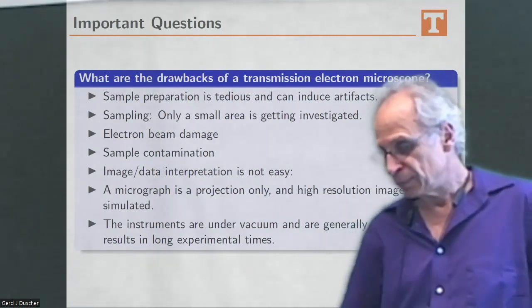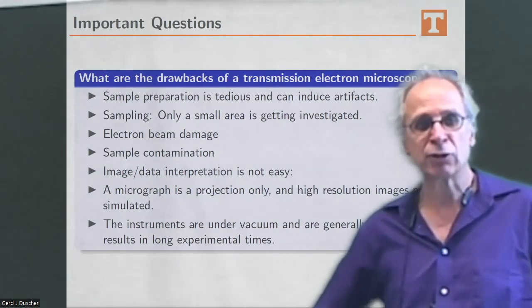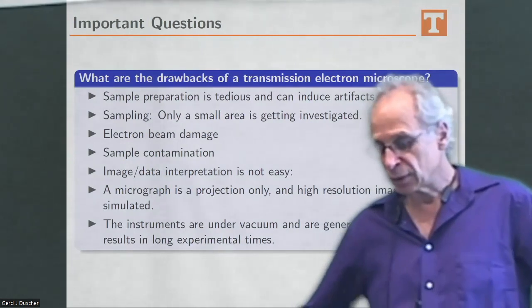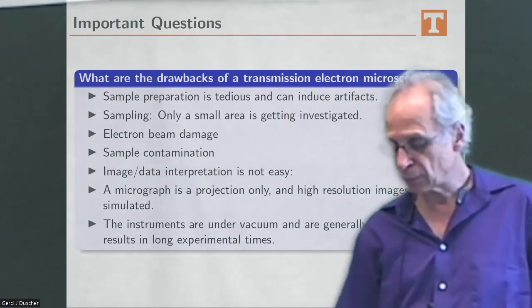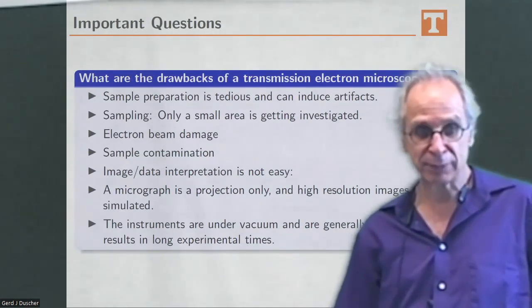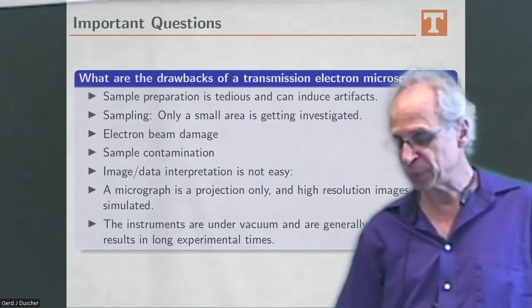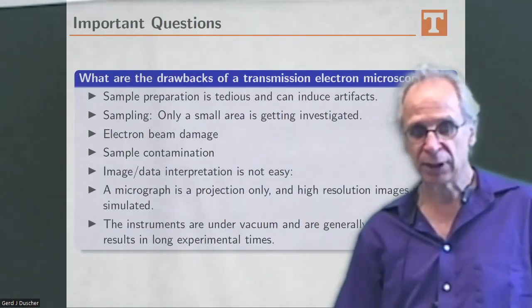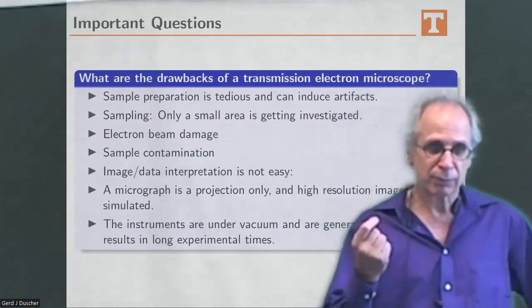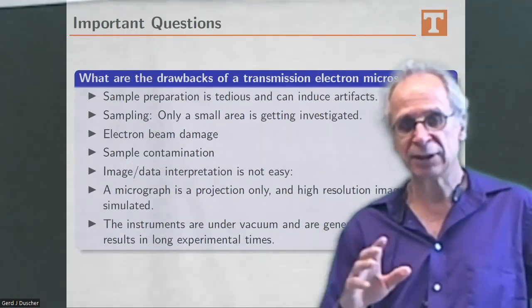They are relatively fragile, so you have to know what you're doing in order to not do something bad to the instruments. And so there is some expertise needed to run them and to set them up. But the key thing is, in electron microscopy, running the microscopes will get easier and easier.